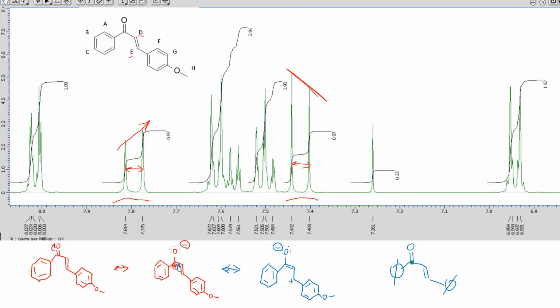This carbon and this carbon are partially positive. And so this is the alpha and this is the beta. So those two carbons that I did the green dots on, those are where nucleophiles would add. And they are also de-shielded. So this carbon and its hydrogens are going to be farther to the left.